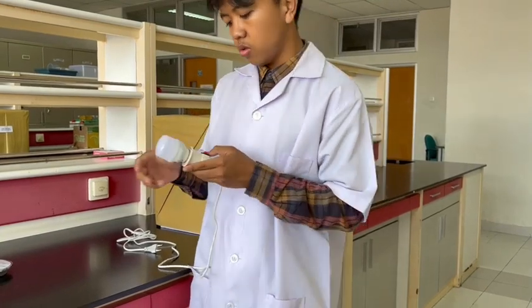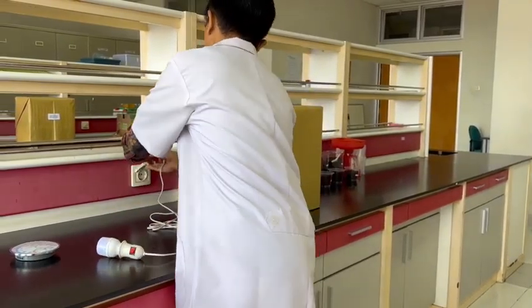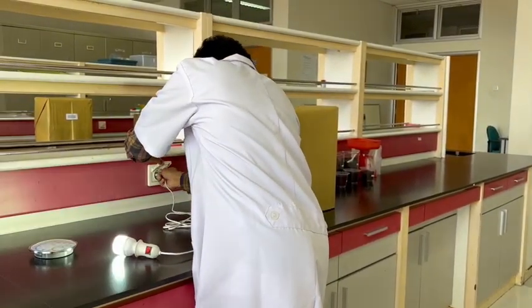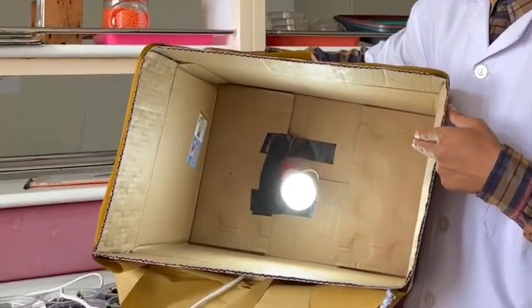Next, set up the electricity like this, and making sure that it works properly. Okay, put the electricity inside the box like this.